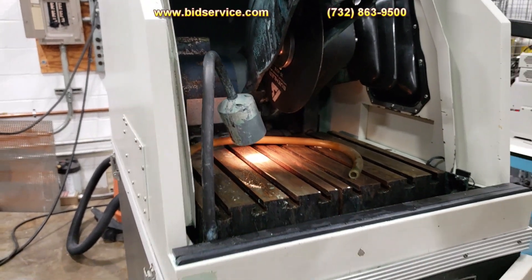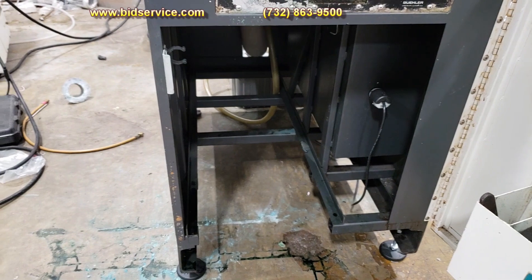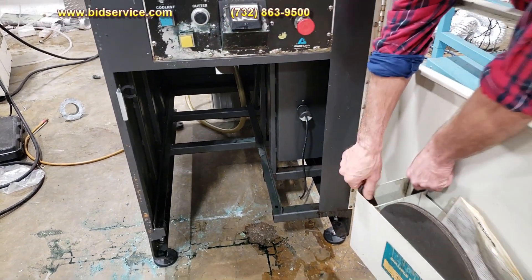Inside here you can see there are a couple of extra blades and some tools to get the blade on and off.